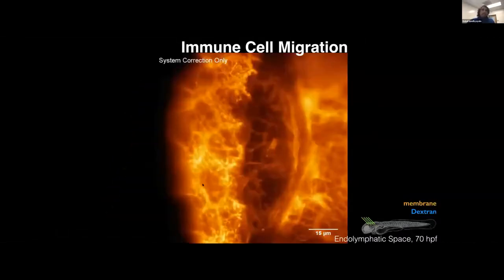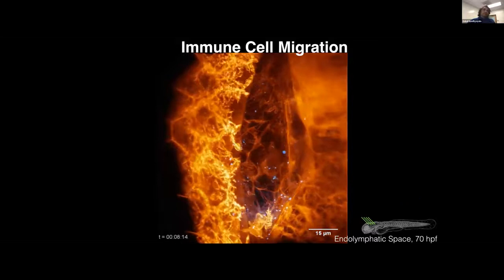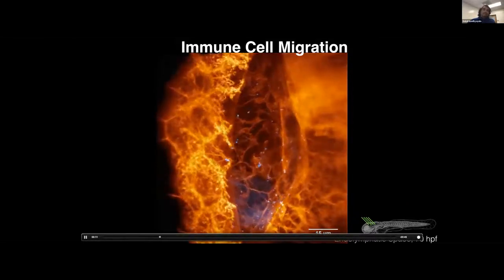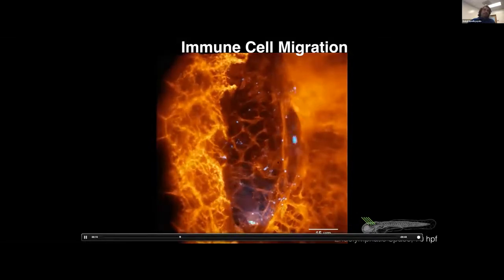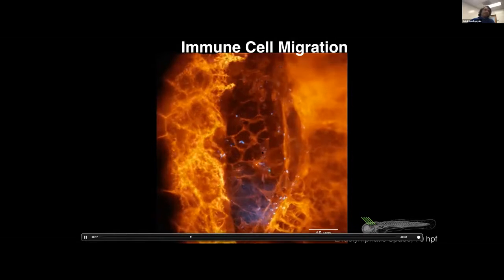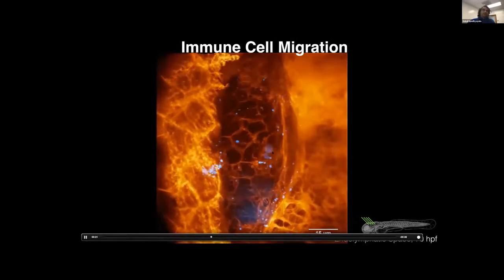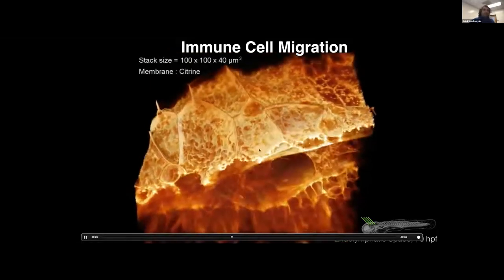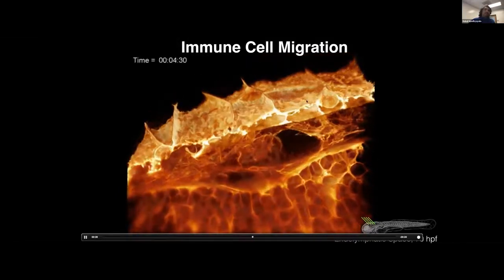And in the last example in this section, I'm going to show you, in one field of view, again the ear region of the zebrafish. So we're trying to study this endolymphatic duct and sac that's regulating pressure as the ear develops. But you can see the immense diversity of biology that's taking place in this one field of view. So in this one field of view, we can look at these ruffling and dancing skin cells.